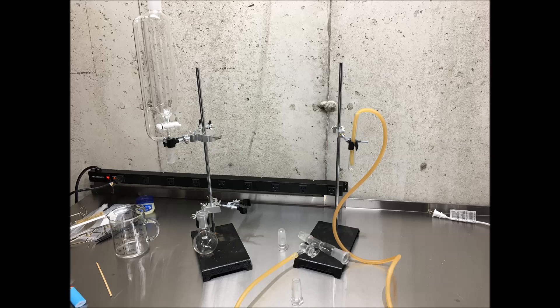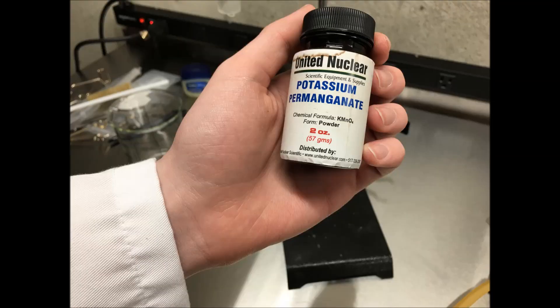Hello, and welcome to another episode of But Preston Did It. Today we will be making oxygen gas from potassium permanganate and concentrated hydrogen peroxide.